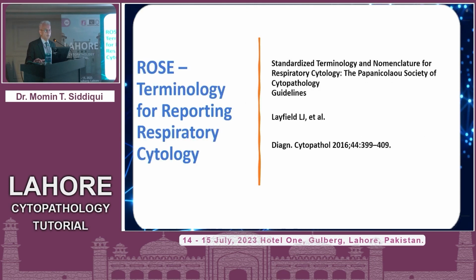So rapid on-site evaluation terminology for reporting respiratory cytology. This is what I will be focusing on today. Basically, it's a 6-tiered system ranging from inadequate to malignant, just like other systems. This was presented to us by the PAP Society in 2015 and then published in 2016. And this is what we have used in our practice for the past couple of years. This is what I have experience on.